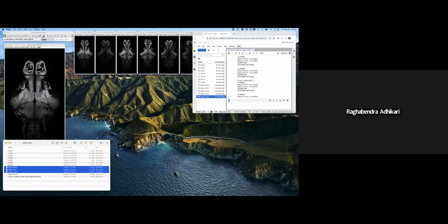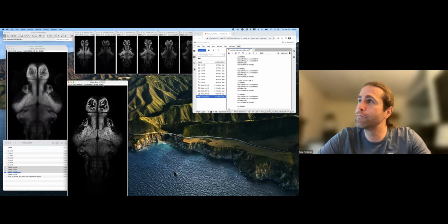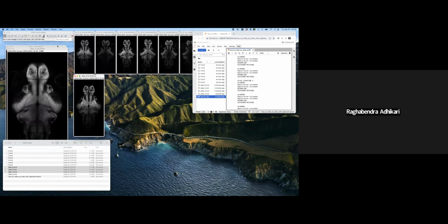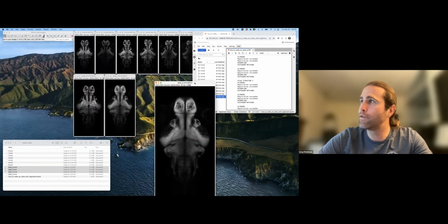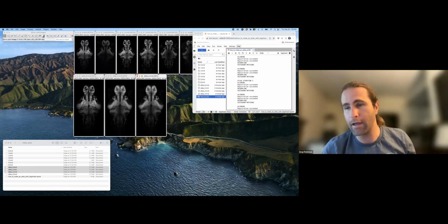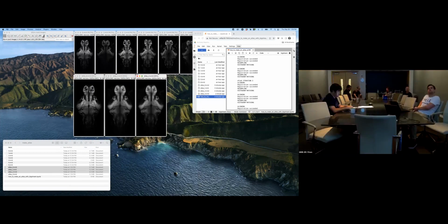I have a question. Sure. So can you also perform this with multiple fluorescence labeling? Sure. It just depends on what you have. So what I'm showing, all of the samples are stained in exactly the same way. They're all from the same exact genetic line.